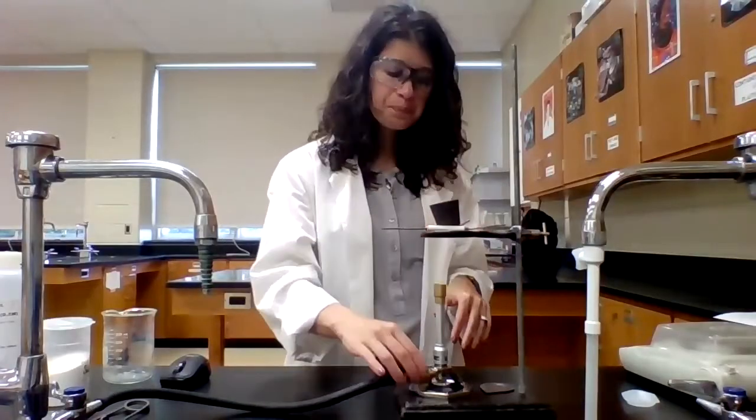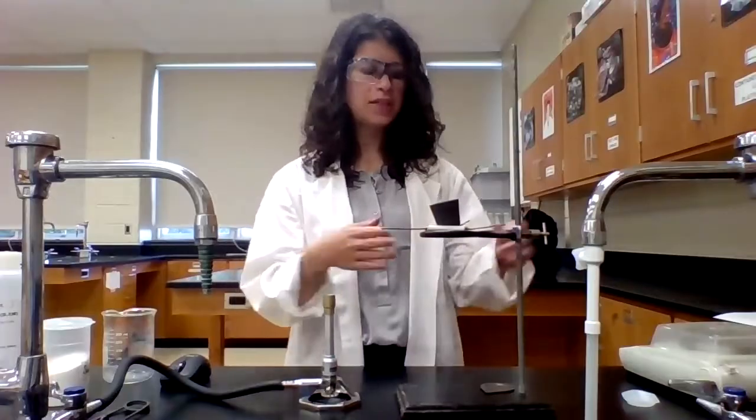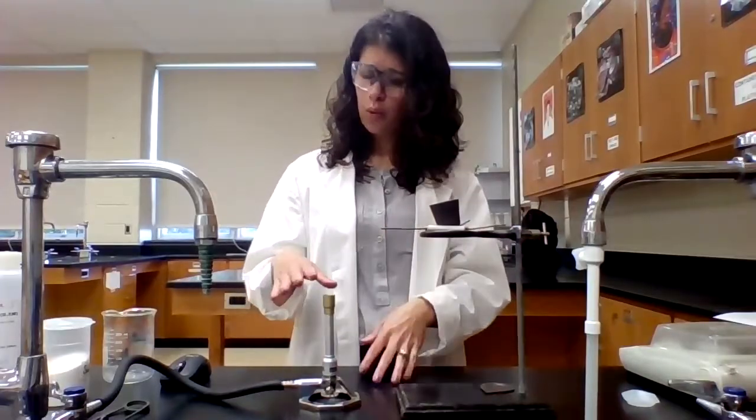But first, like I said, I need to heat up this crucible to make sure there's no water present on it. So I first want to light the Bunsen burner off of the ring stand. The reason I'm doing this is that if I need to adjust the height of the iron ring or the height of the flame, I don't want to have this here. I turn it on and now this is getting hot and I can't touch it. I can't raise it or lower it. So I just move it off of the ring stand.